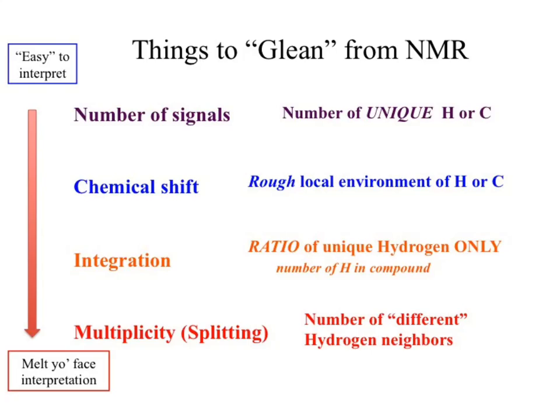If you look at carbon spectra, you can see a splitting effect as well with them. I'll leave you to read the textbook on it if you want. I'm not going to ask you about that version of spectra this semester. Okay? So the splitting part is absolutely the hardest part. Once you've done all of that, it's now just a question of interpreting it and putting it all together. As simple as that.